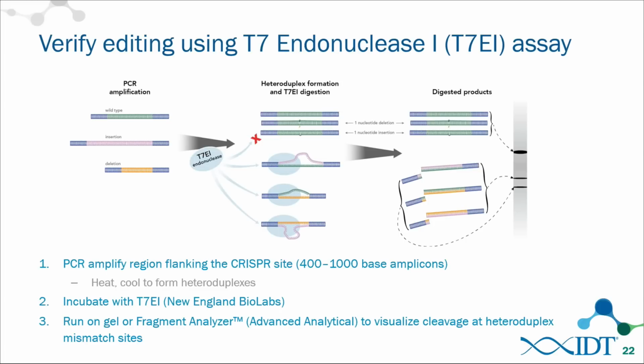And our final readout then is an electropherogram in which we see a full-length PCR product. Those would be the undigested products at the top, and then we would see the cleaved fragments that would have sizes specific to the site of crRNA double-stranded break.